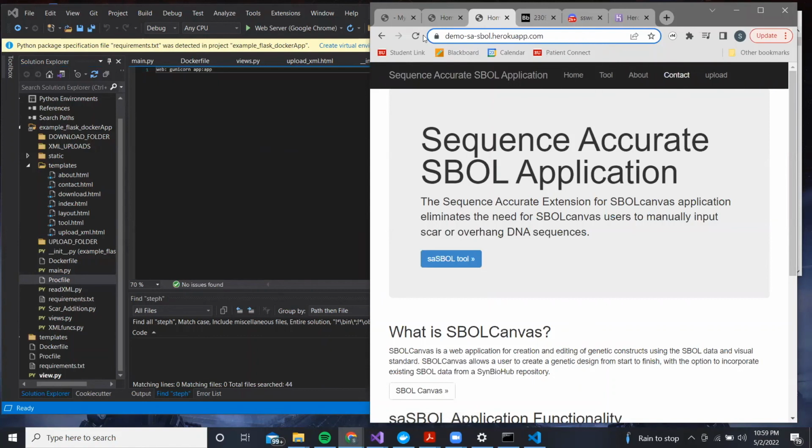As you see, these tabs are a little bit different from our final app, but this was a beta demo for the web app because we came to find out that the web app needs a paid database in order for us to communicate with the user. So they can't get our downloaded file. It just won't go to their computer because of that paid database feature and security issues between local computers and the web. In the future, we could pay for that and have our web app fully functioning, but until then, we will be running it locally.